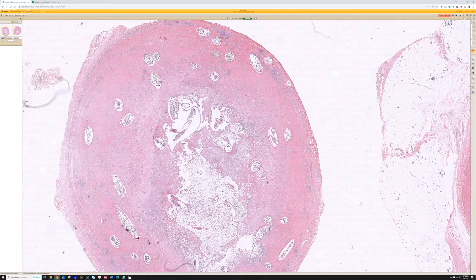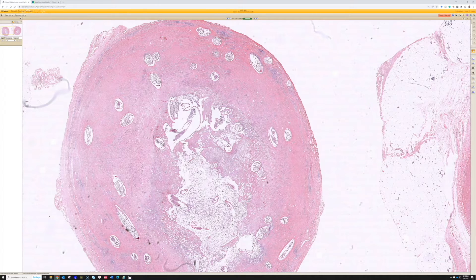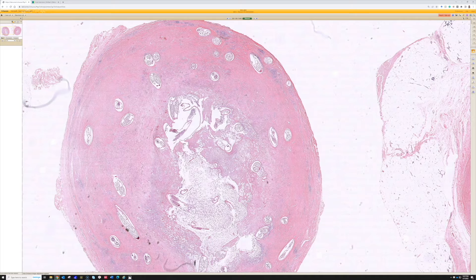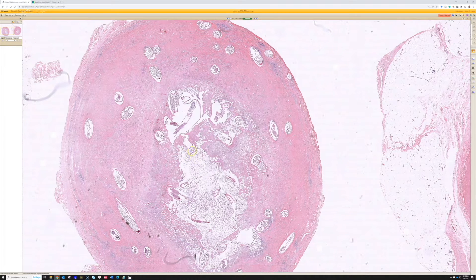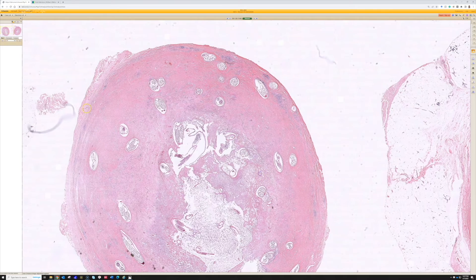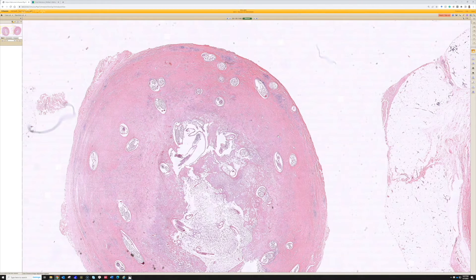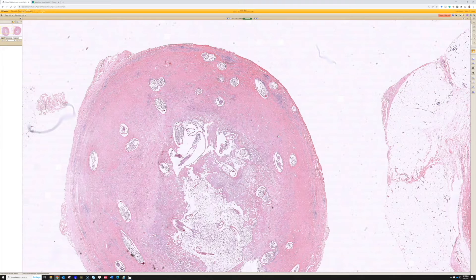And then the microfilaria proliferate throughout the skin and infect the skin of the person and eventually mature into adults. The adult worms get coiled together into a ball, usually in the deep dermis or subcutis. And that's what we see here. The body mounts a kind of a response against it and encases this ball of adult worm in fibrosis and inflammation.